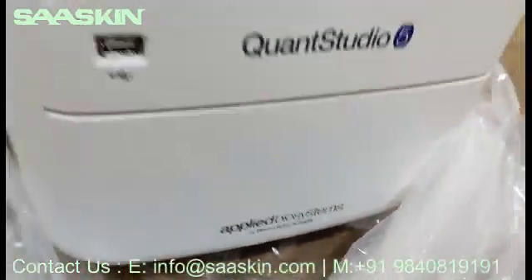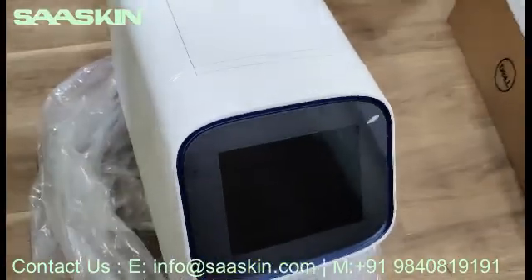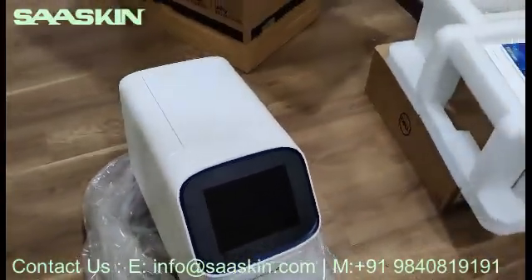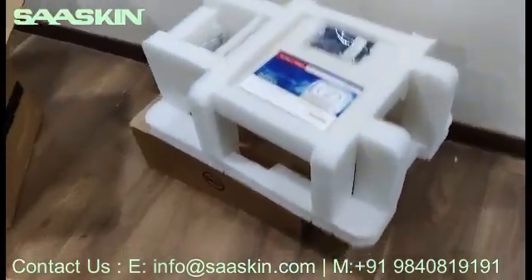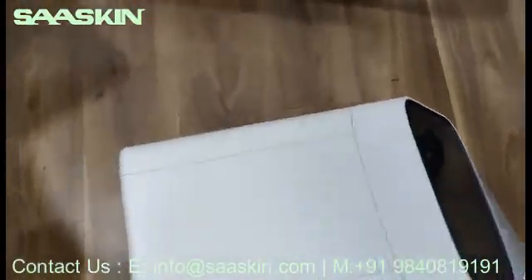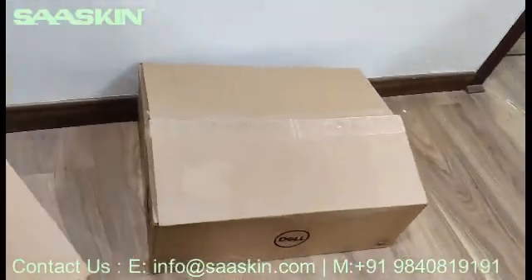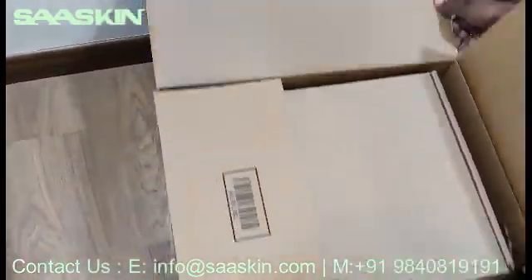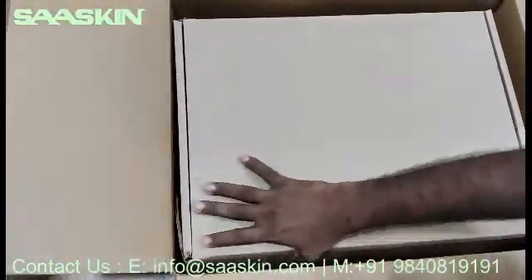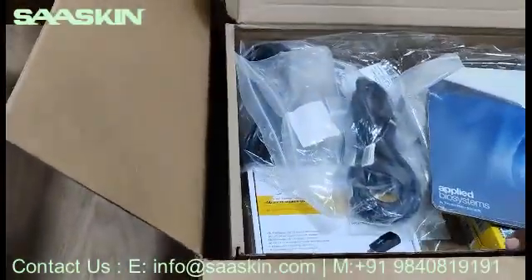This is the QuantStudio system by Thermo Fisher Scientific. This is the front monitor. We are not setting it up now — we are just showing the unboxing and the kit contents. This is how the instrument looks like. I want to show you the accessories that come along with it. We selected this particular instrument type along with the laptop monitor.